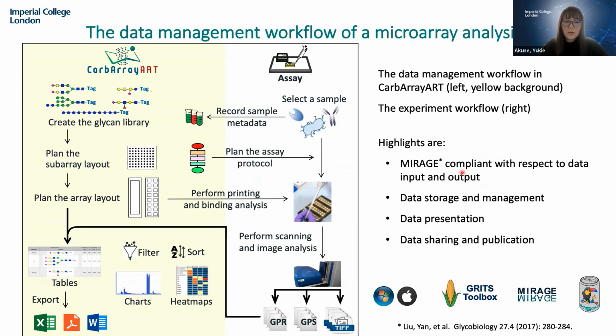For the MIRAGE document, it was introduced in the last talk, so I'm not going to talk any details, but please watch the video or please go to the paper if you are interested. Then CarbArrayART is for day-to-day data storage, also data presentation in tabulation, charts or heat maps. Also data sharing through the other CarbArrayART software, or exporting as PDF, Excel file, or Word file.